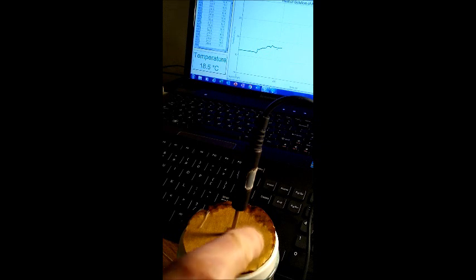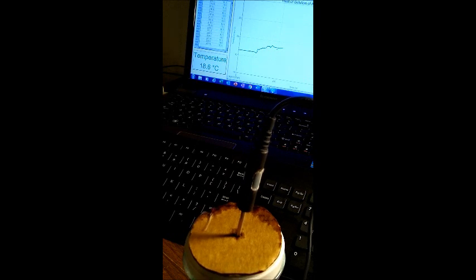I got a little bit of water leaking out here, actually KOH solution. That's okay. You wouldn't want to get that on your skin, so to speak. So again, I think we've reached a constant temperature. Let's just give it about 30 more seconds and see if it goes up any more.